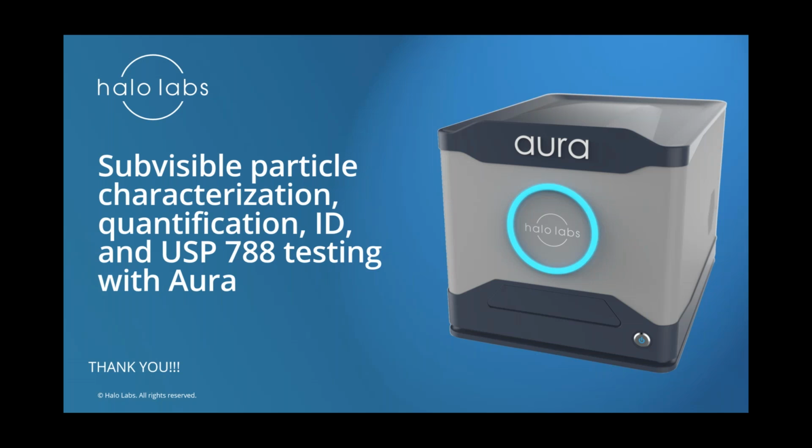We can measure them for different serotypes with volumes as low as 10 microliters. We could probably even go lower. And yes, they do stain with thioflavin T, and we've even shown that we can distinguish those with non-proteins also present in those formulations.